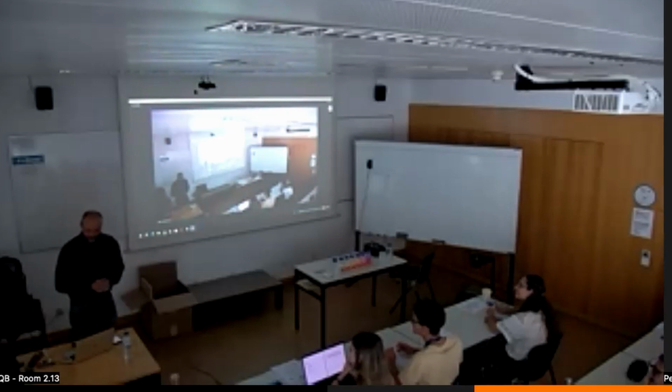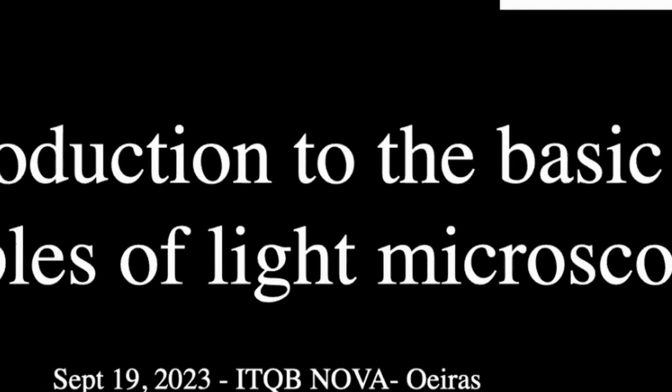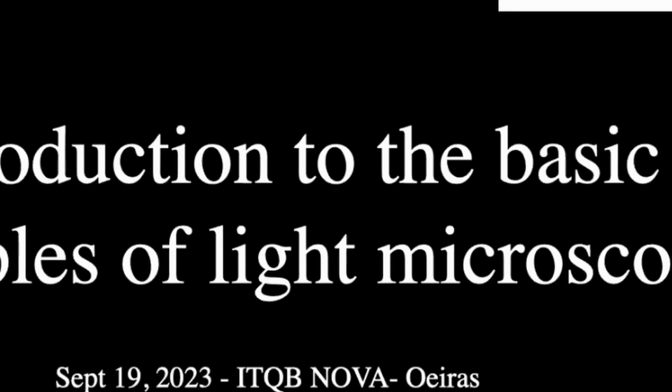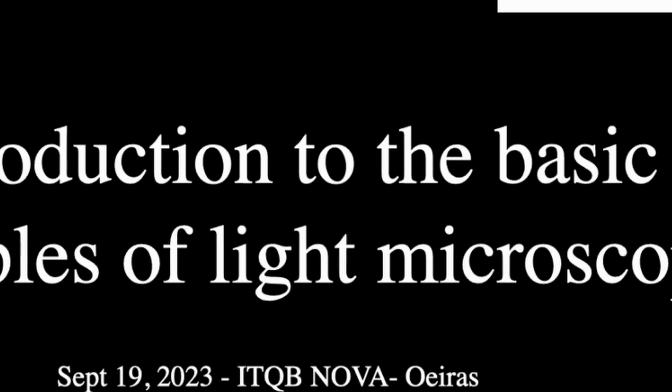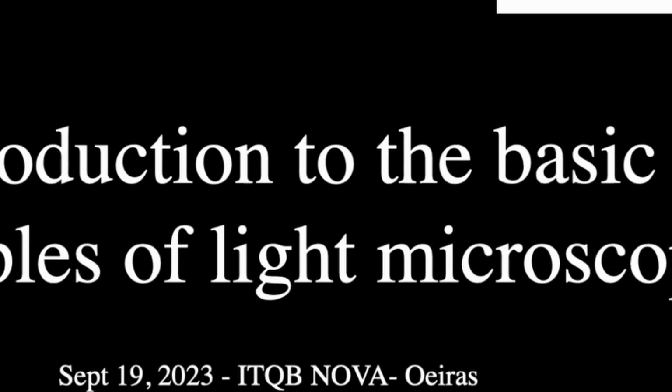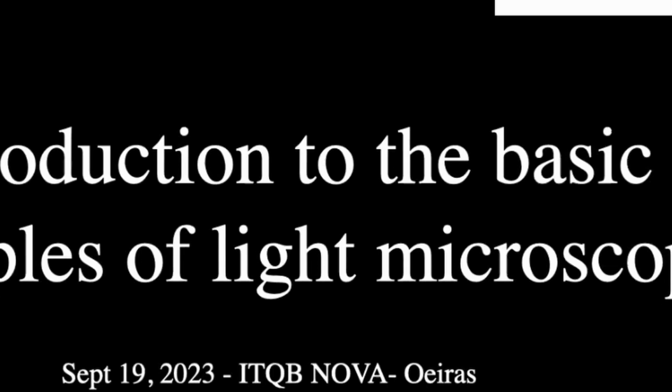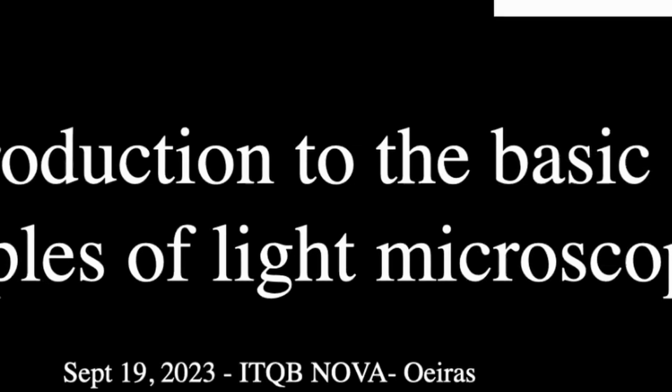Thank you for the fantastic introduction. I'm the head of the ABBE platform at Champalimaud, as Carolina was saying, and I will make an introduction of the basic principles of light microscopy. The basic principles of light microscopy are relatively simple concepts, but there are many and they are extremely important, and they are all linked together. They have consequences for all the techniques that you will use afterwards, from confocal to light sheet to two-photon, super resolution, everything that you will do, because they are related with the image formation principle.